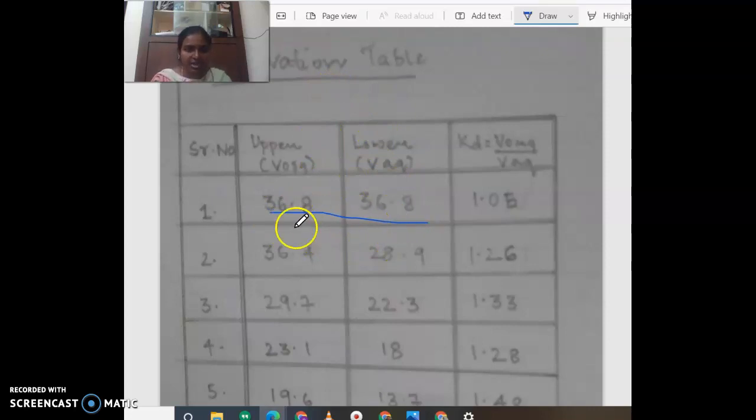Next, what you have to do to the reagent bottle for the second titration: to the reagent bottle we will add 10 ml of N-butanol and 10 ml of water. Again, for 15 minutes we will shake it and keep it aside.